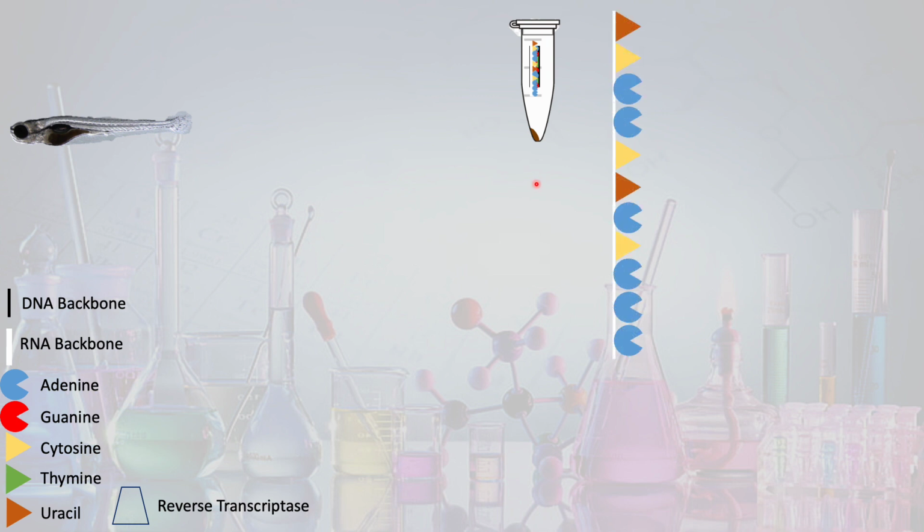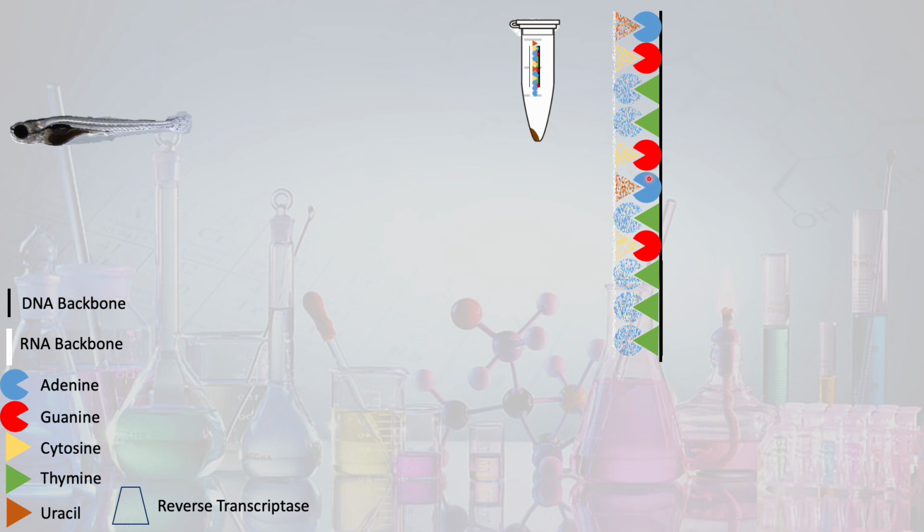And so what today we're doing is calculating how much RNA we need to prepare and provide for our RT reactions, right? Our reverse transcriptase reactions. See how much of our RNA samples we need to provide and set up so that we can actually perform our reverse transcriptase reaction, which is going to selectively convert our mRNA, right, using that poly A tail and our oligo DT primers, into cDNA. So this is the calculatory steps that are involved in this process, and that's what we're doing this week.